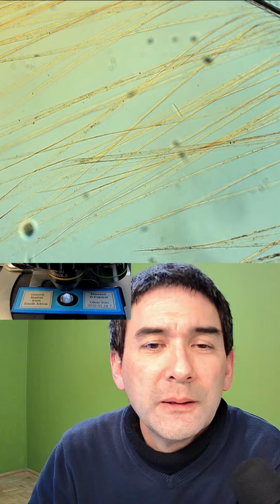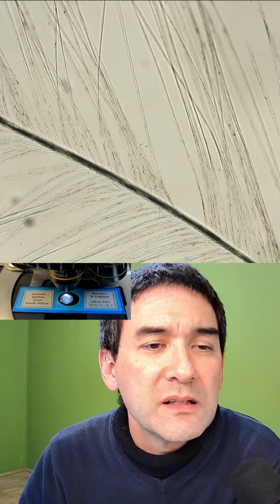But this here is the feather of an ostrich, and because I've got DIC, I'm just going to look at it in bright field. But it looks a little bit like this feather has survived the past. Well, in this case, 16 years, because I made the slide a few years after I visited South Africa. So that is the feather of an ostrich.